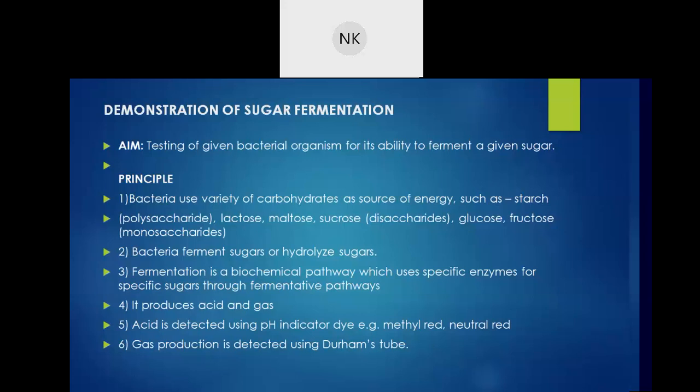We can detect and demonstrate those end products produced by the microorganism by performing this experiment, that is sugar fermentation or carbohydrate fermentation.